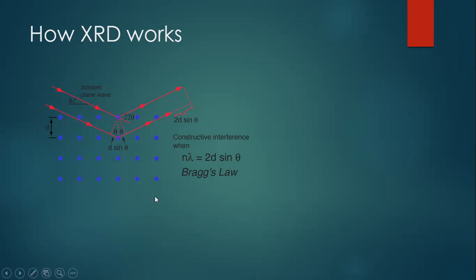What happens if the X-rays are scattered by periodic arrays of particles with long-range order? In this case, the scattered X-rays from the sample will interfere with each other. This means that the detector of the XRD can only read out a signal at the angles where the interference occurs.